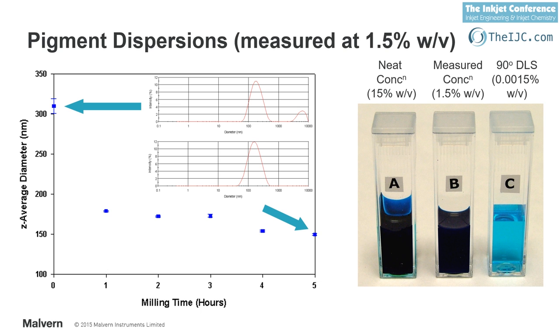Yes, you mentioned that the technique is effectively measuring the hydrodynamic radius. Do you notice much of an influence if you go from a low molecular weight dispersing material to a high molecular weight polymeric dispersing material? So is that what you're dispersing it into? What you're using to stabilize the pigment? Or attaching to the particle to stabilize?